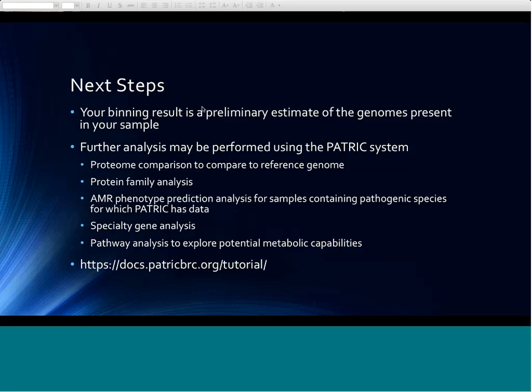I will say, however, that in the spirit of the other analysis tools that we have at PATRIC, my view of the PATRIC service is that part of our goal is to have an integration of useful services that are available from the community, and we've had some discussion of providing integrations of other binning tools as well in the binning service.